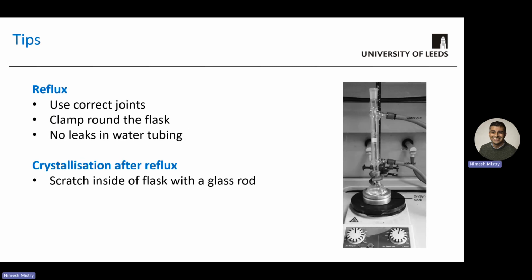Finally, for this briefing video, I just want to cover some key tips to help ensure that this experiment runs smoothly for you. When you're setting up the reflux apparatus, you've got a number of different pieces of equipment and glassware that you're using. So it's about making sure that you set everything up correctly and in a safe way as well.